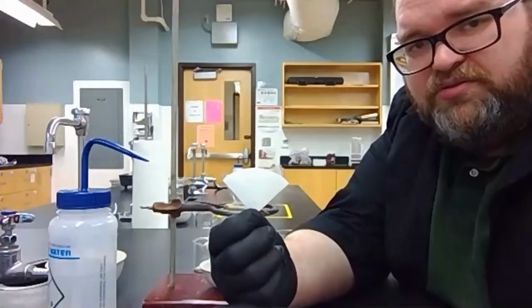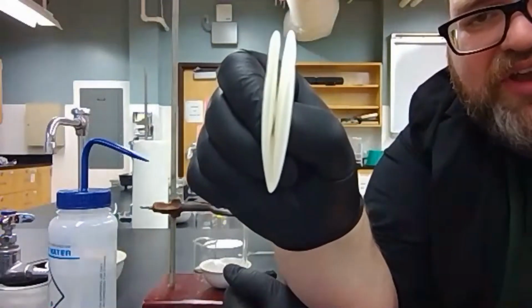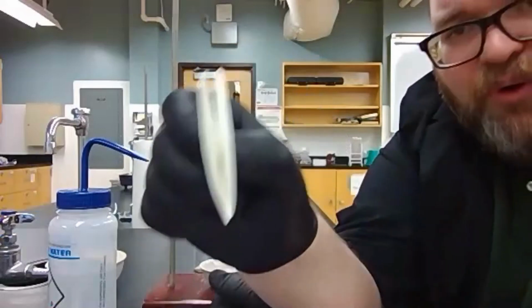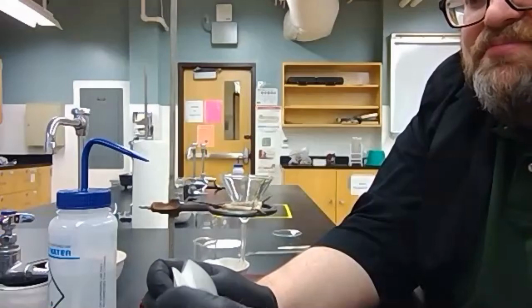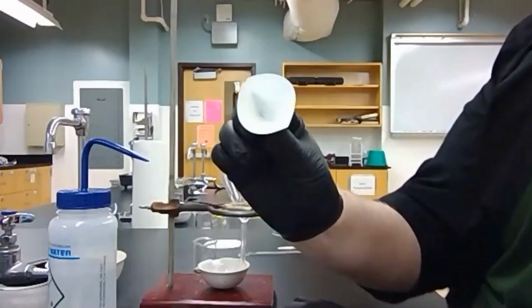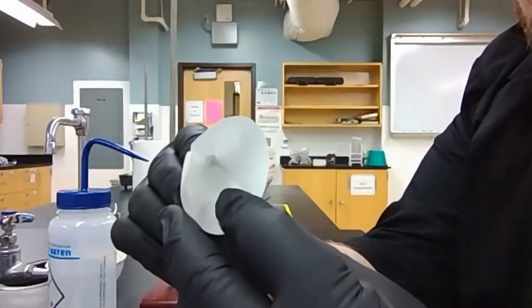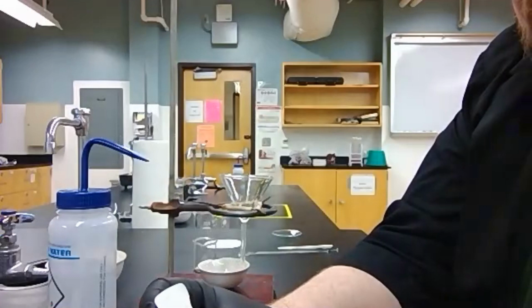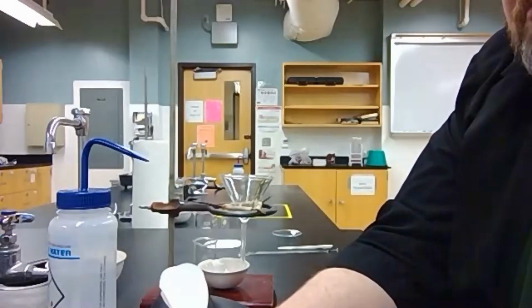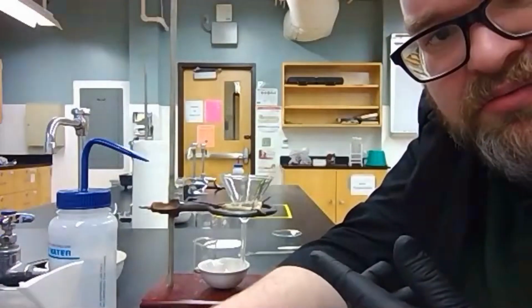this conical shape. Now, you'll see that there are 4 edges that are facing you, right? I'm going to gather 3 of them together and 1 of them separate so that I push it out like a snow cone or a raspas cone. Okay, that you would get at like a baseball game, like a little league baseball game, not the good ones, but the cheap ones.